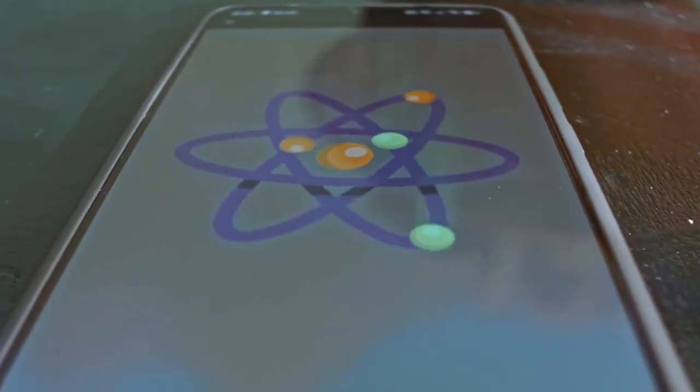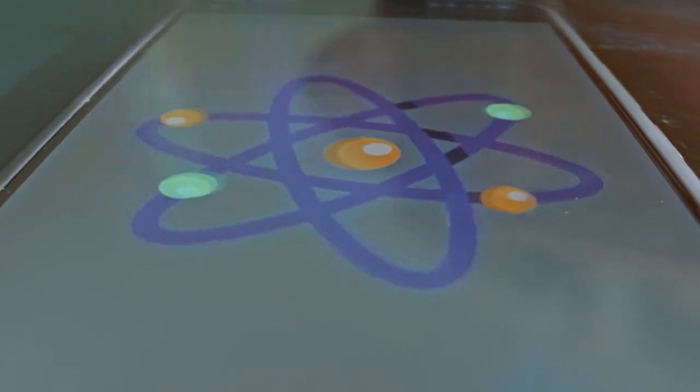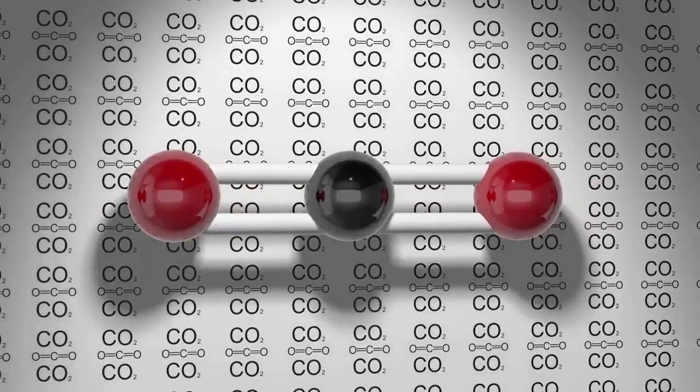Third, we can even get clues from CH bonds. Look at the region around 3000 wave numbers. Peaks that appear just to the left of 3000 indicate CH bonds on double bonds or aromatic rings. Peaks just to the right of 3000 are from CH bonds on saturated, single-bonded carbons.